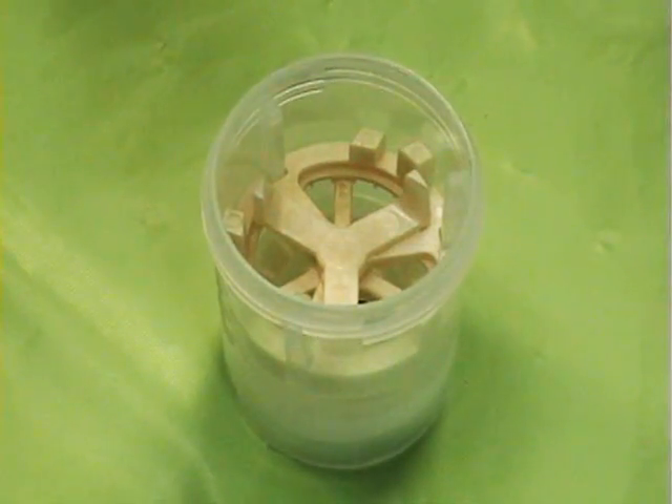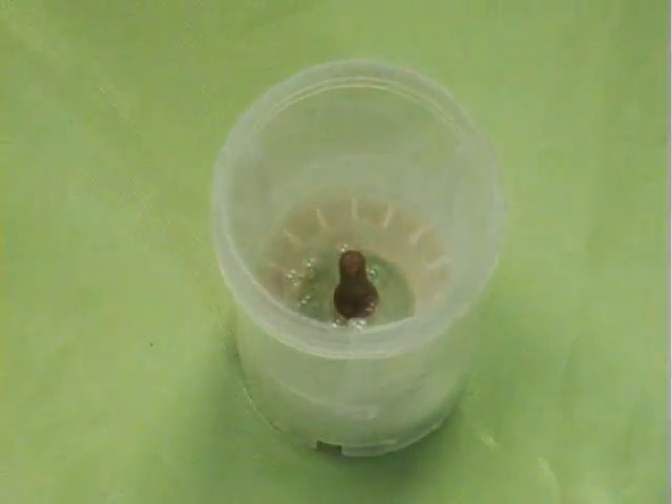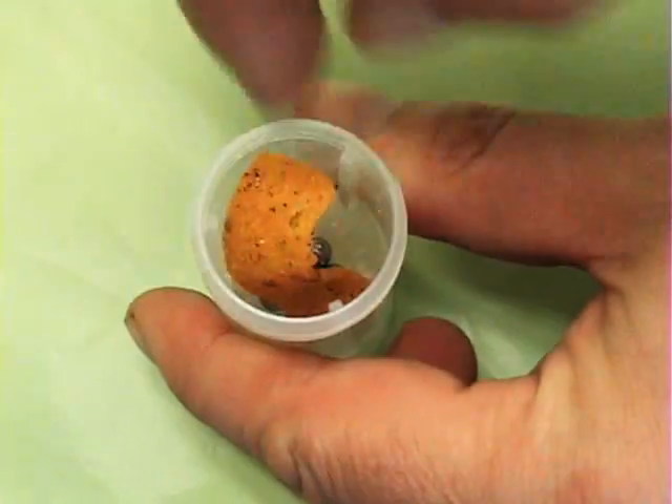Use with the DT tube with rotor stator element, the ST tube for mixing and stirring, or the BMT tube for grinding and macerating hard and brittle samples.